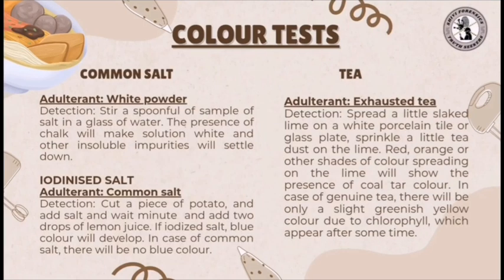Now, common salt. To check for the presence of white powder in common salt, we stir a spoonful of sample of salt in a glass of water. The presence of chalk will make the solution white and the other insoluble impurities will settle down.